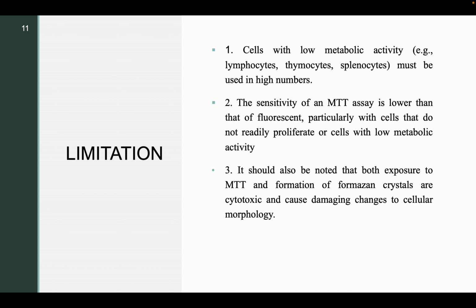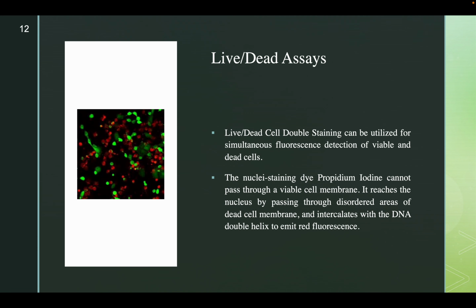Any technique that we have learned before can measure cell viability. There are a lot of techniques that can measure cell viability, but I will give you the technique that another member in my lab reported in her previous report, and it's very popular: live dead assays. In live dead assays, they use PI, named propidium iodide.